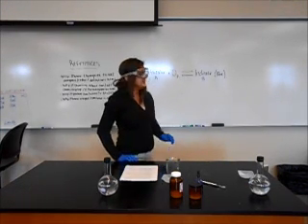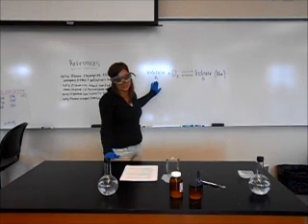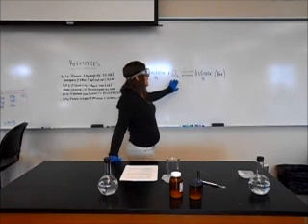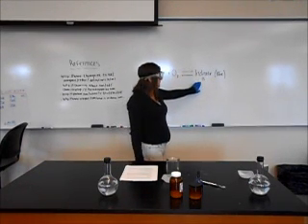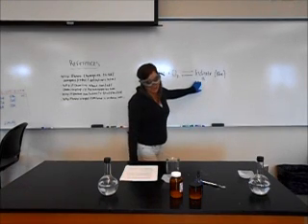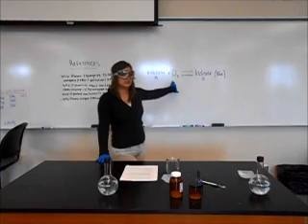And a good way to see this is here with this equation. Indicator A is the original solution, and it reacts with oxygen, so if you go to the right it causes it to turn blue. So that is your oxidation, and then when you go back the other way it's your reduction because you get your indicator A and your oxygen again.